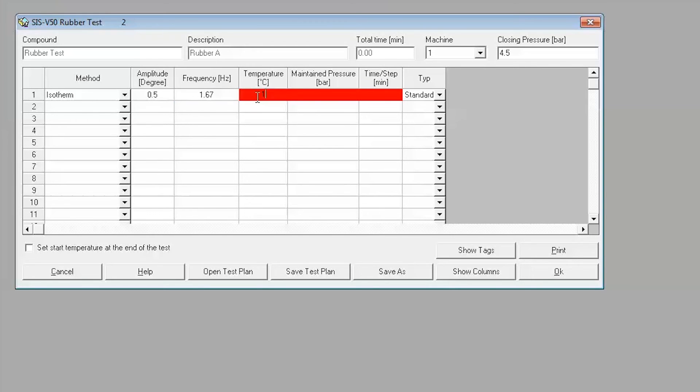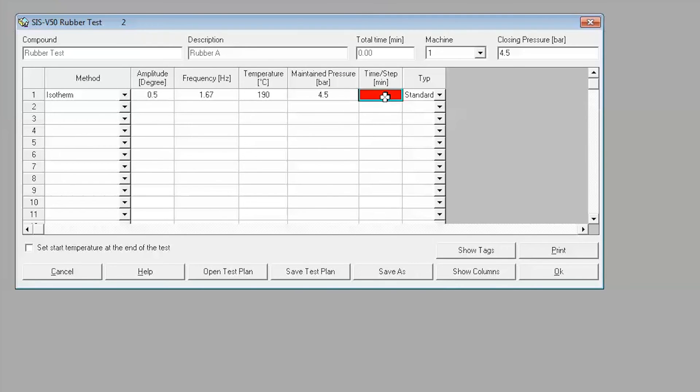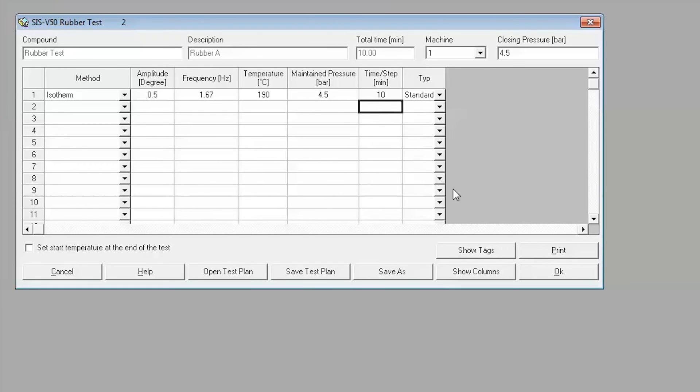This test method can be combined with other steps such as frequency and amplitude sweeps, which can be used to characterize the sample further. Once all parameters have been entered, click on OK. The test plan will be saved upon exiting.